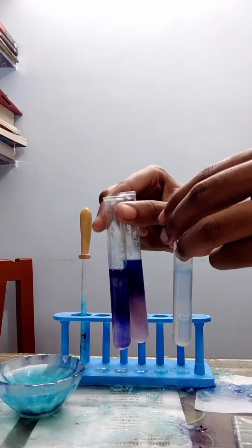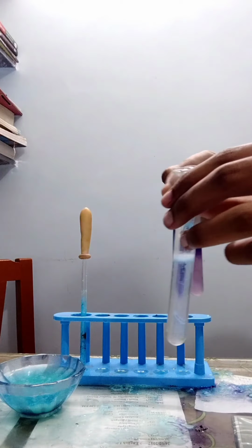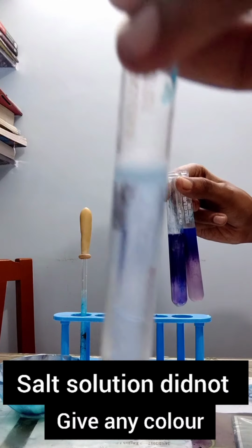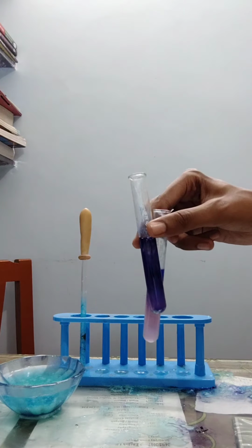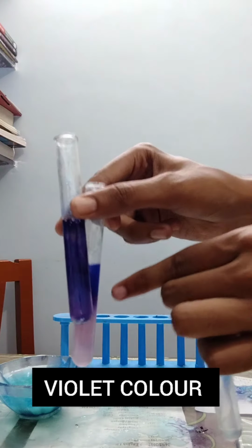Seeing the amount of violet color given by these three solutions after the BIURET test, we may conclude that the salt solution does not have any protein content because it is colorless. On the other hand, milk and egg yolk both contain proteins or peptides. Thus, they have given violet color.